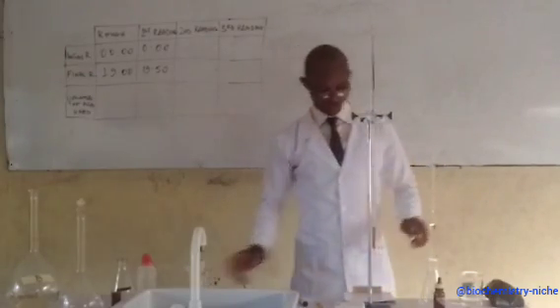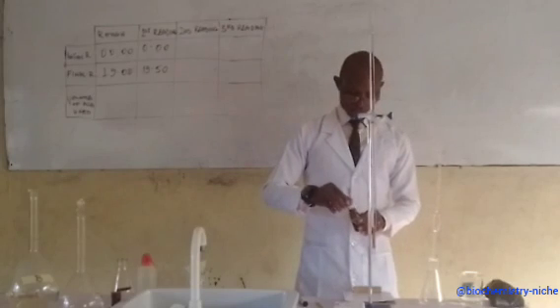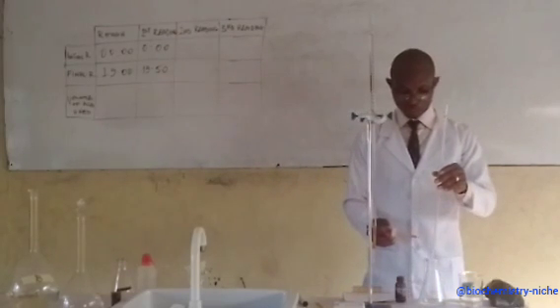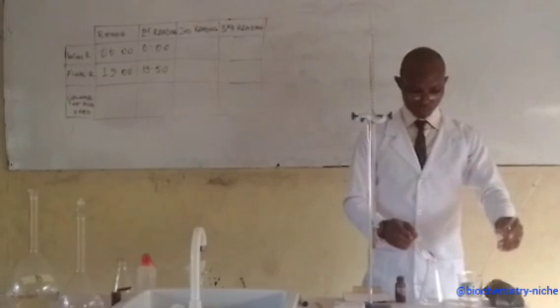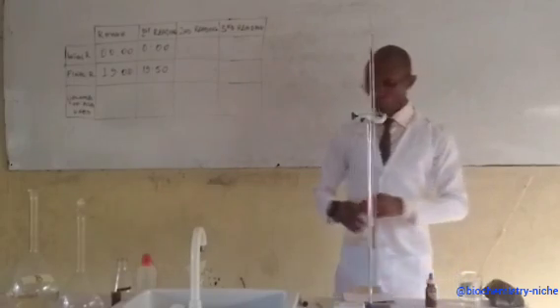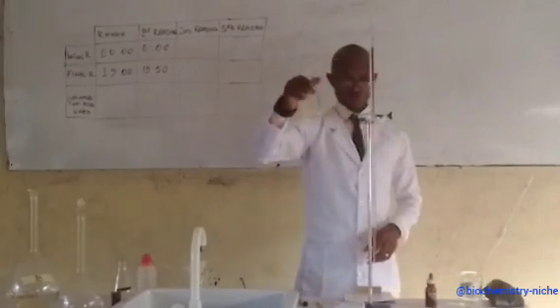So the content of my pipette is empty right now. So let me add 2 drops of the methyl orange. I've added 2 drops of the methyl orange. So this is what I have, the golden yellow color like we had before.